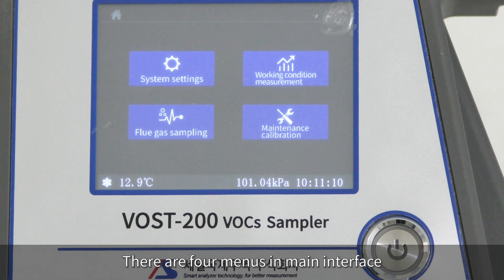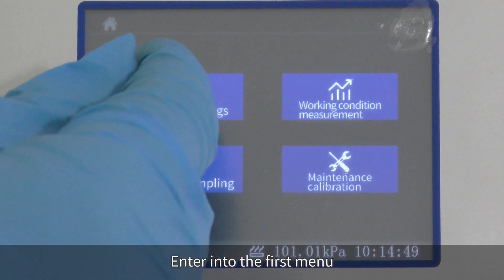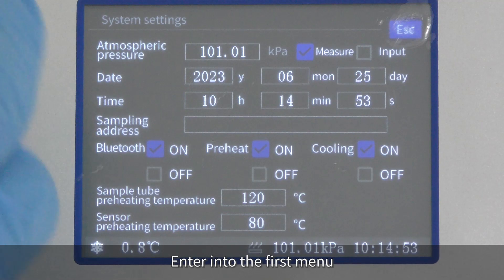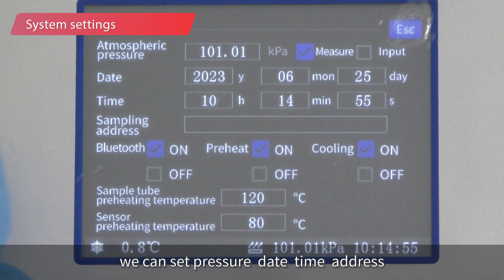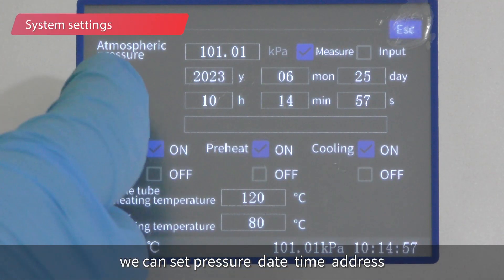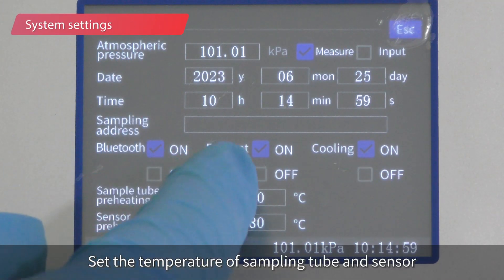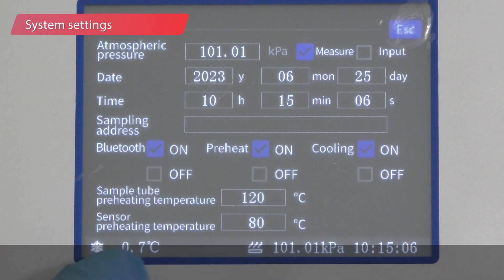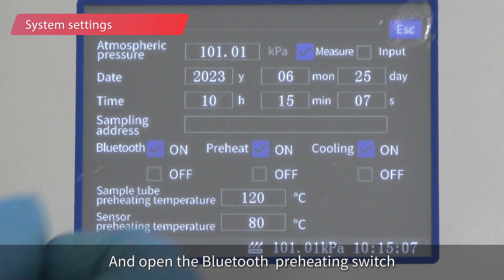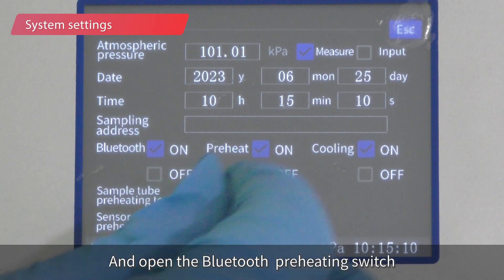There are four menus in the main interface. Entering the first menu, you can set pressure, date, time, and address. You can also set the temperature of the sampling tube and sensor, and open the Bluetooth preheating switch.